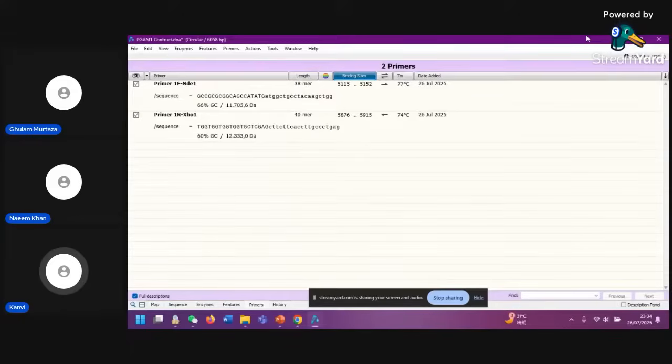Thank you, sir, for explaining it. Miss Fatima, you have a question which was left unaddressed. Kindly, you can retype it. Till that time, I have a question for sir. As per your experience, what difficulties have you faced in softwares you have used for primer making, and which softwares are the most reliable and most accurate for making primers, since it plays a very important role in any biotechnological amplification? If you can answer it.